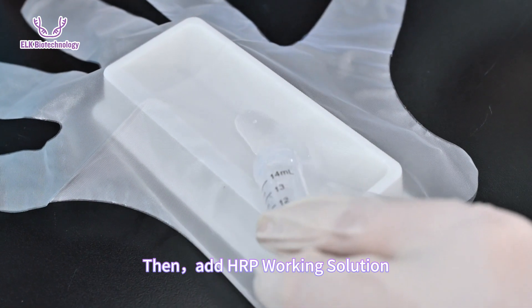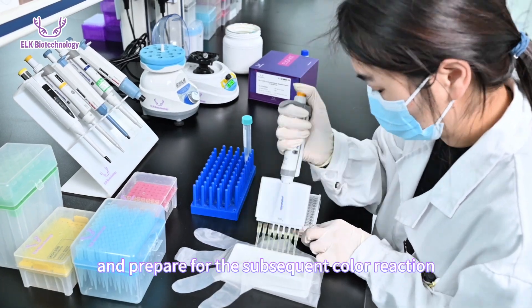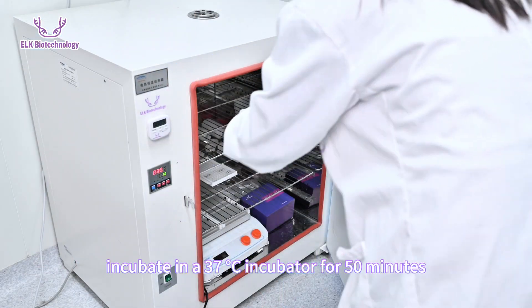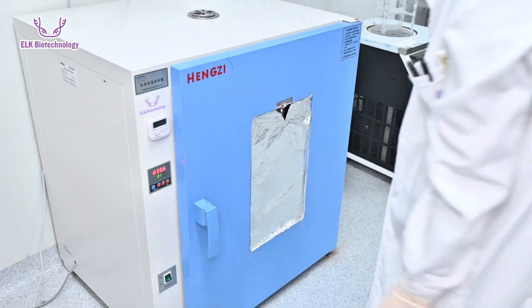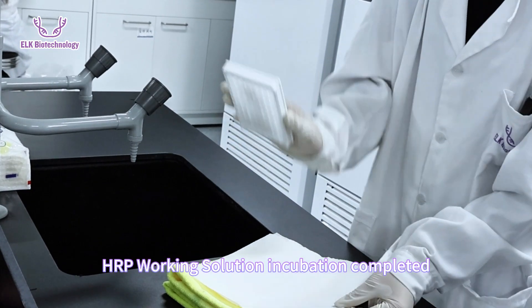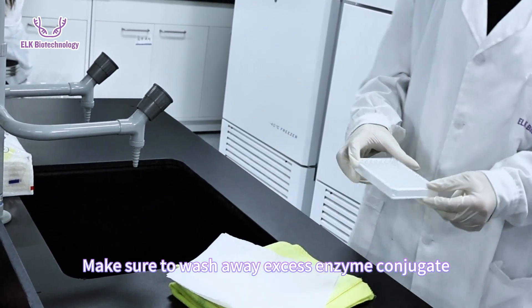Then add the HRP working solution, which will bind to the detection antibody and prepare for the subsequent color reaction. After dispensing, incubate in a 37°C incubator for 50 minutes. Once incubation is completed, wash the plate five times to wash away excess enzyme conjugate.